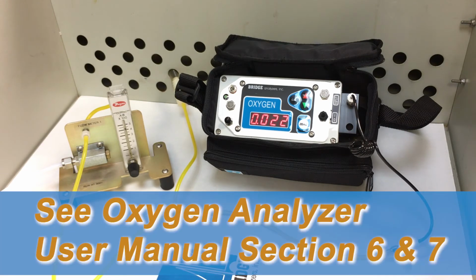Our user manual, section 6, describes everything I've talked about here. So if you want to refresh your memory on things, you can follow along in that section 6 in the user manual.